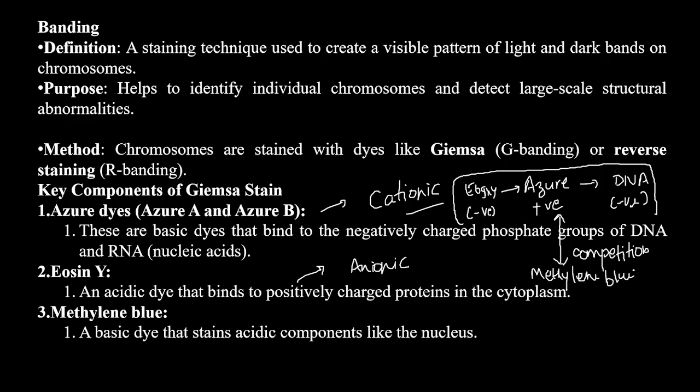Because of this, you will have a good contrast, and you can see the banding pattern in a better way. So this is the whole principle of the banding, if you want to study the chromosomes or structural modification in the chromosomes by the banding pattern.